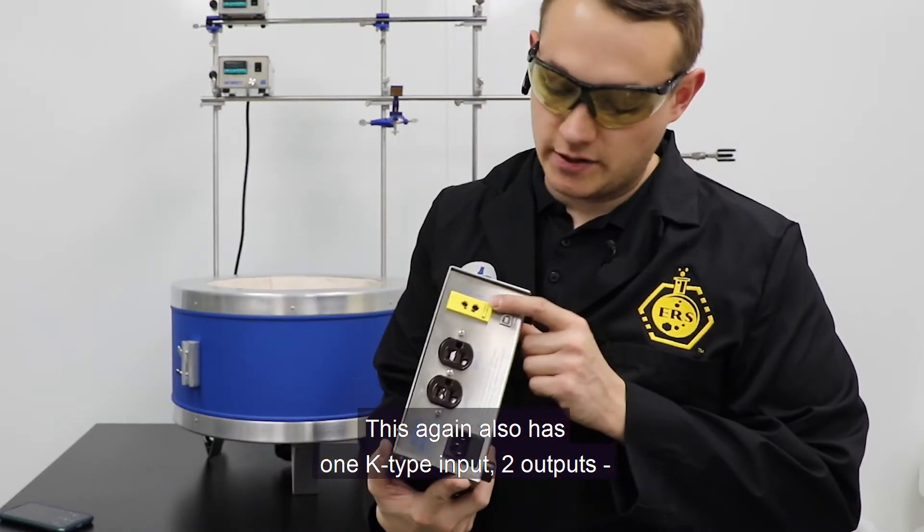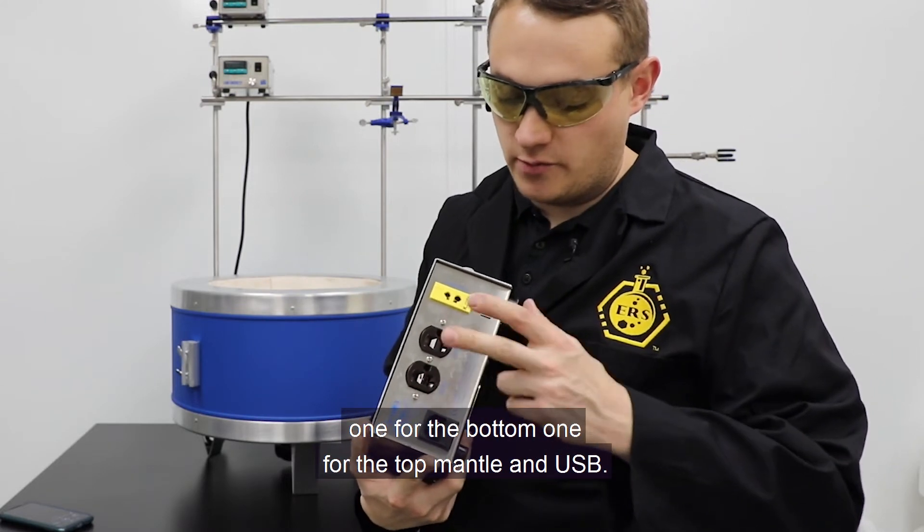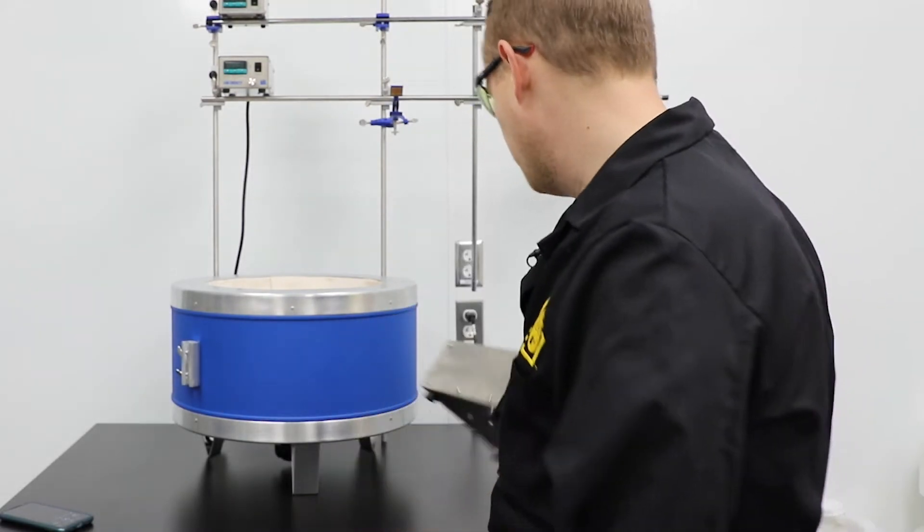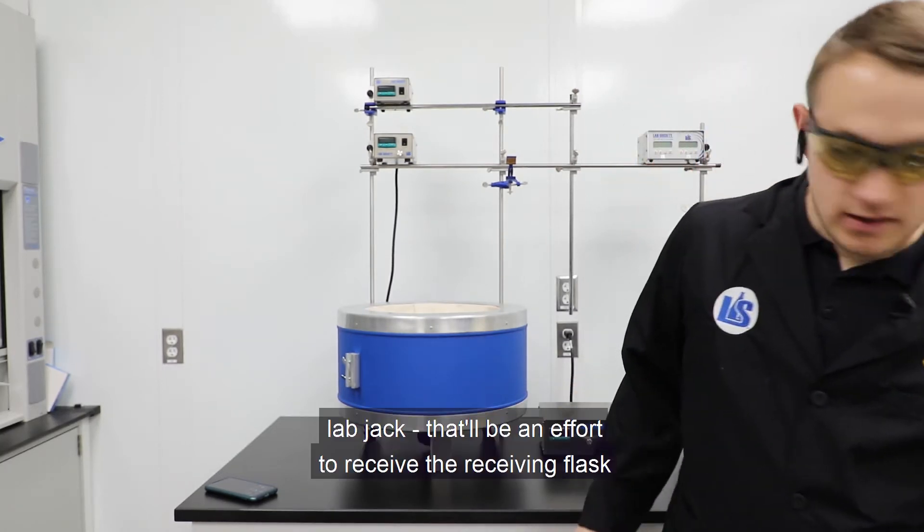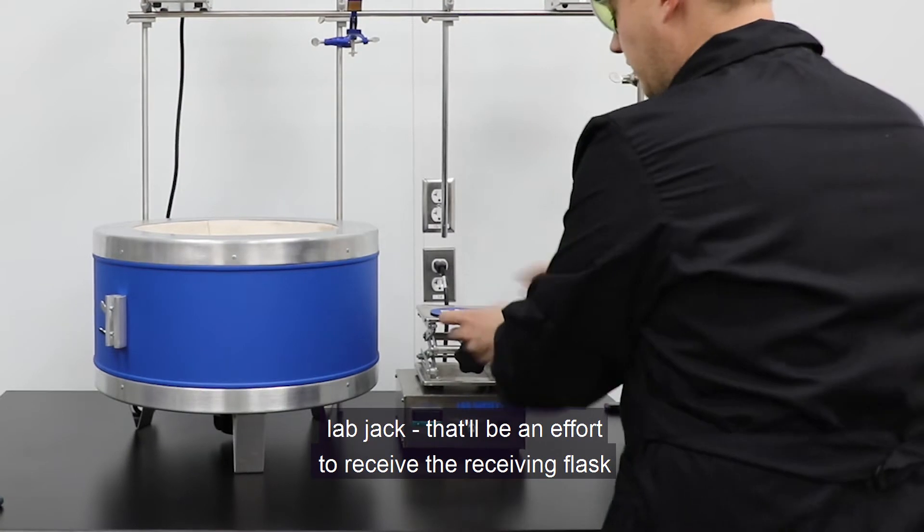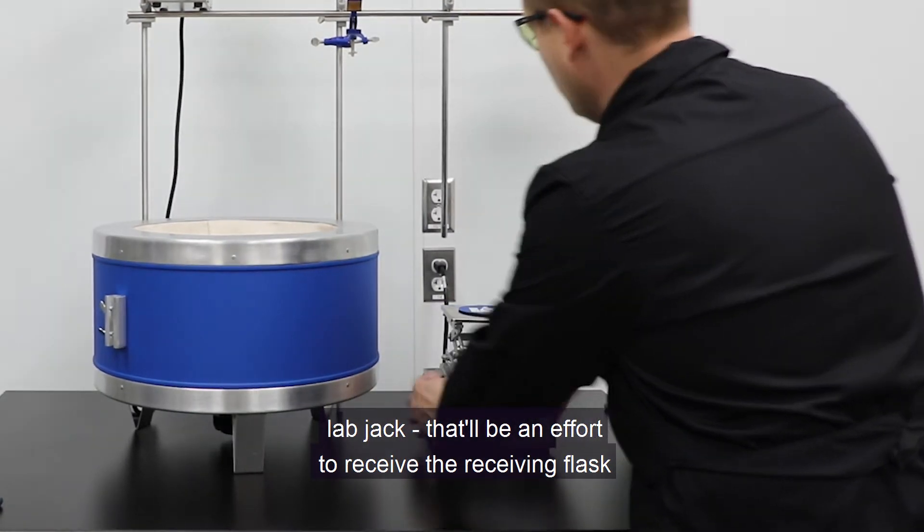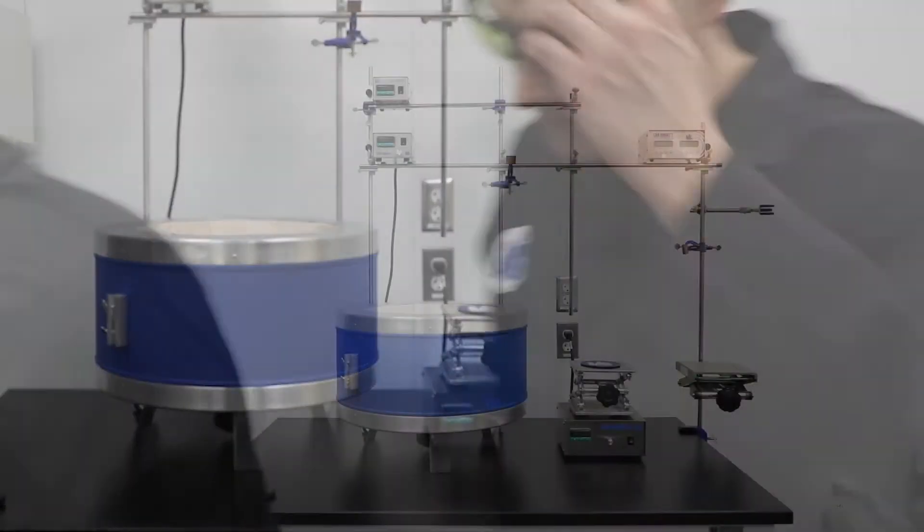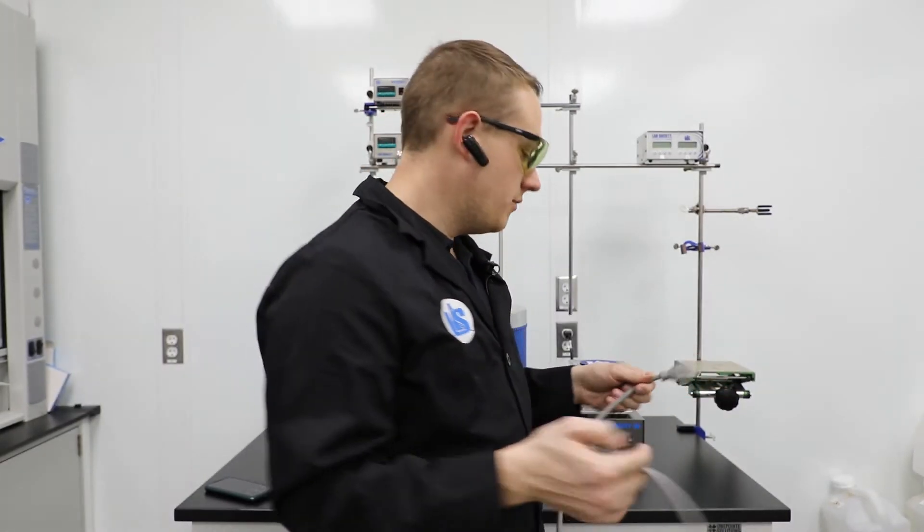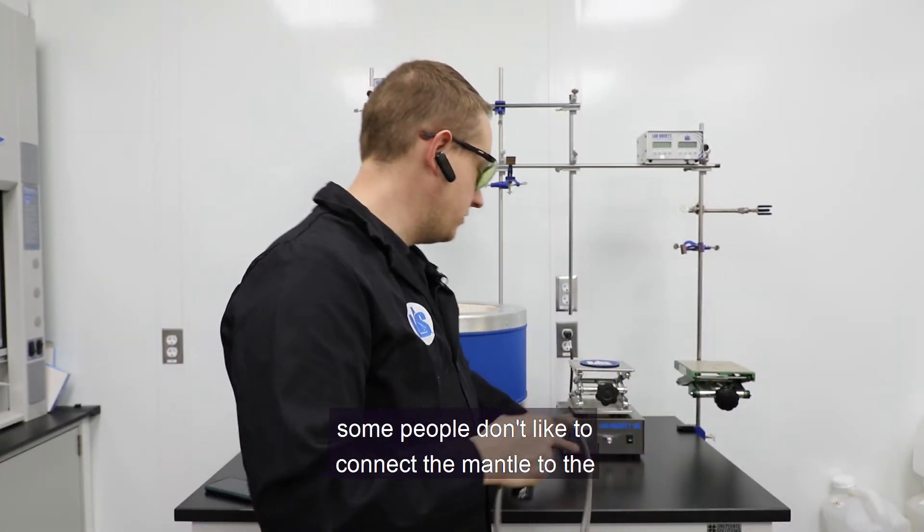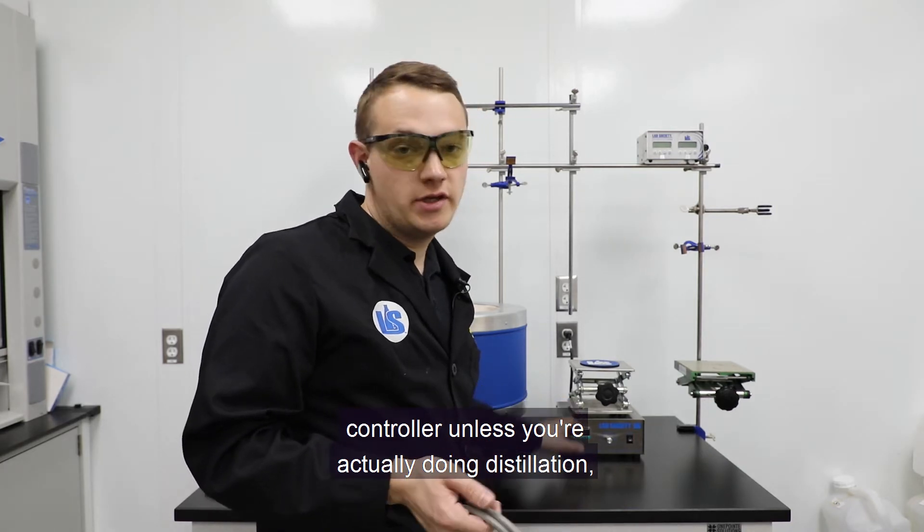So this, again, also has one K-type input, two outputs, one for the bottom, one for the top mantle, and USB. This is typically put right here so that I can actually put my lab jack on, and that will be in order to receive the receiving flask as it comes down. So my bottom mantle is going to be a twist lock connector. Some people don't like to connect the mantle to the controller unless you're actually doing the distillation, which makes a lot of sense.